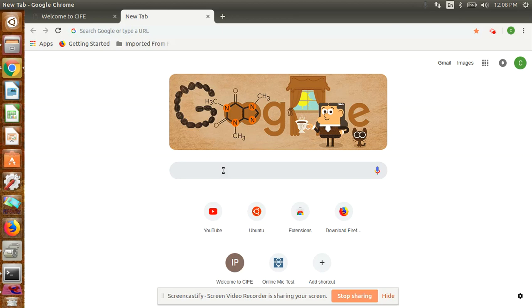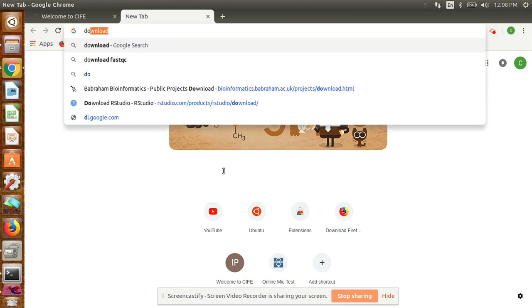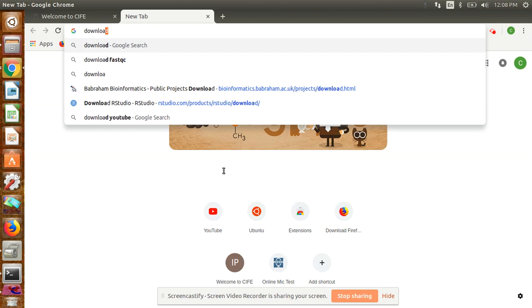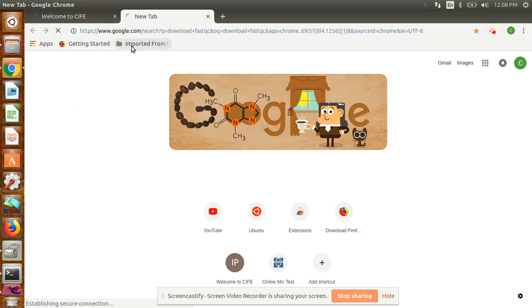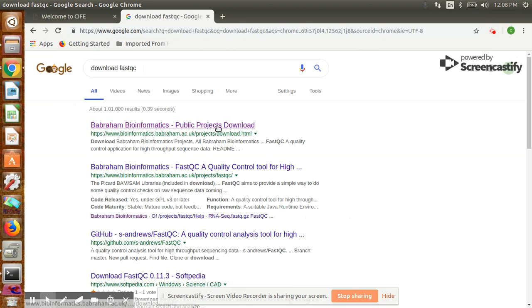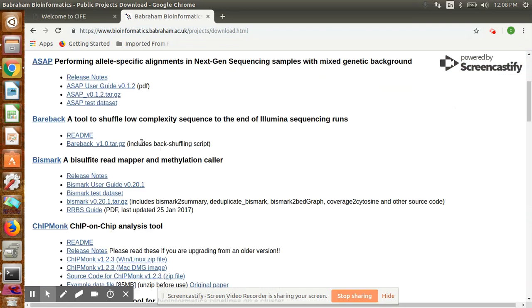The most cited software, which I also use, is called FastQC. For Ubuntu, we have to download FastQC. For that, you can write in Google 'download FastQC' and the first link will come up.